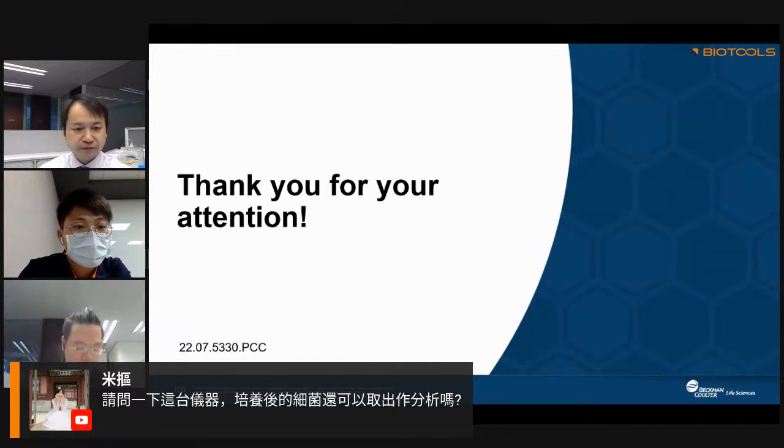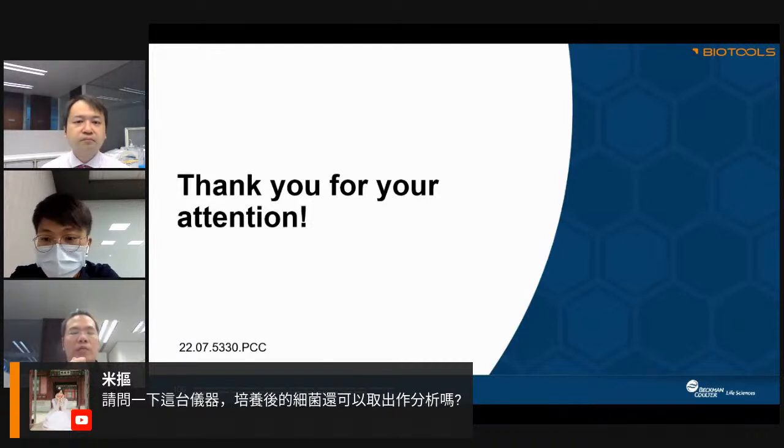Okay, so technically it is a reactor which is micro-sized, below maybe 1 to 2 mL. After the experiment, you can take the plates and open them up, and the medium is exactly what you would expect from a flask or a conventional bioreactor.